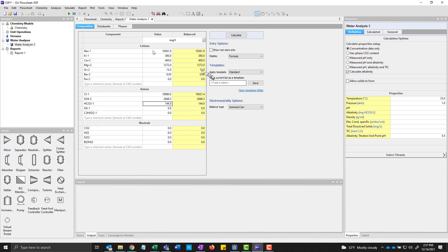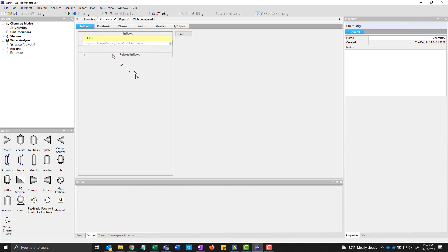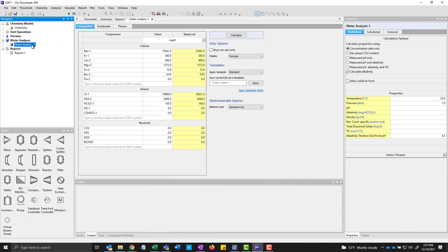We can then do some other analysis here. I'm actually in the aqueous framework. I'm going to switch quickly to the MSE framework and go back to my sample here. And it should be in MSE.